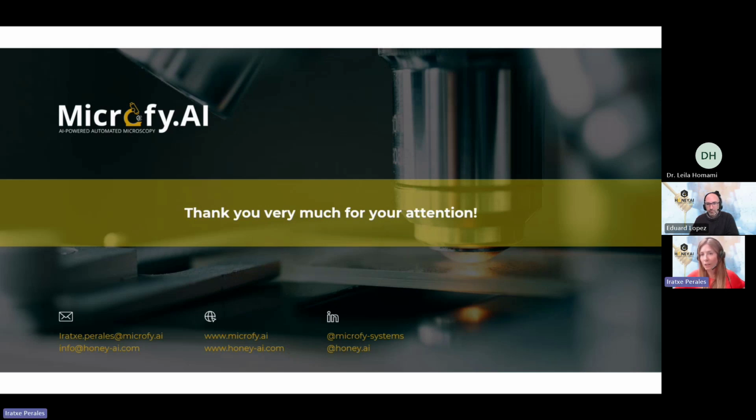The unknown category also exists when a human expert does an analysis. Human experts also have challenges when doing a pollen analysis, so there is an unknown category which human experts also use. In this case, the warning is if it's above 14.